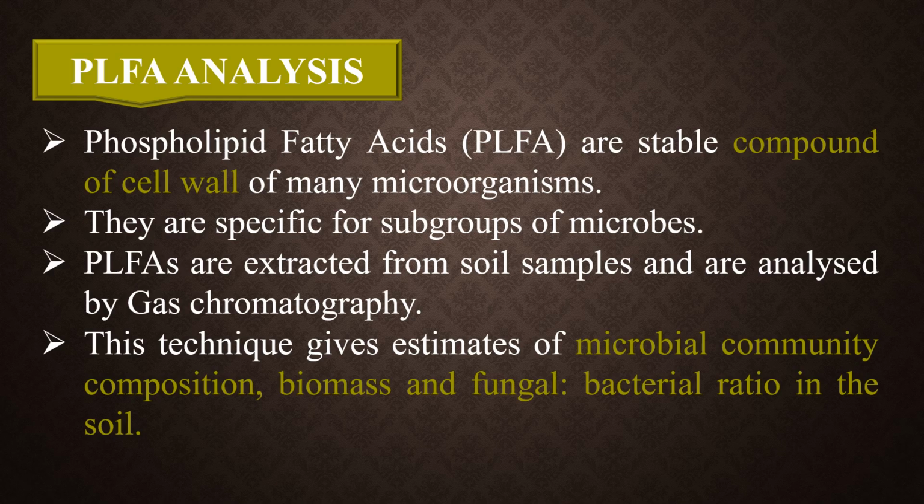PLFA analysis. Phospholipid fatty acids are stable compounds of the cell wall of many microorganisms. They are specific for subgroups of microbes. Phospholipid fatty acids are extracted from soil samples and are analyzed by gas chromatography. This technique gives estimates of microbial community composition, biomass, and fungal bacterial ratio in the soil.